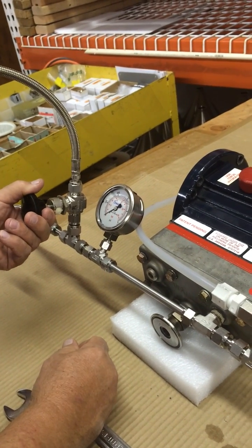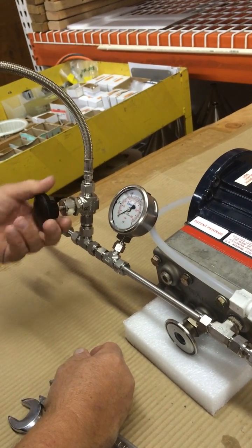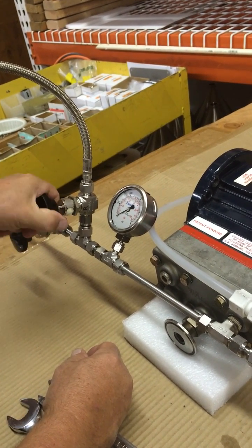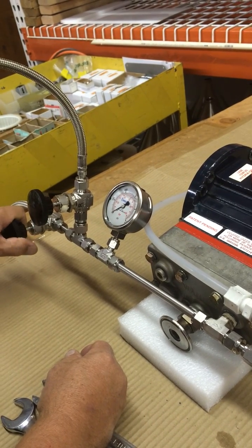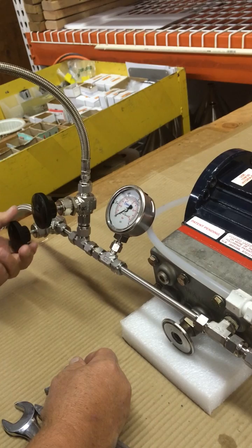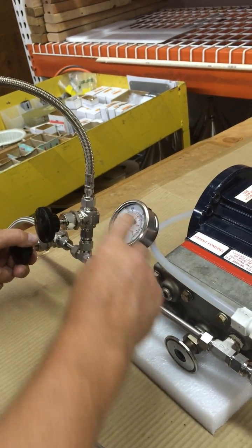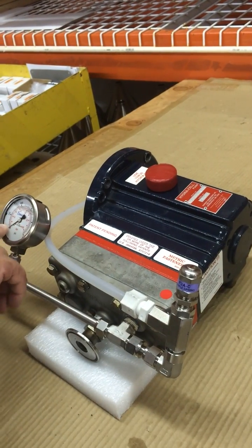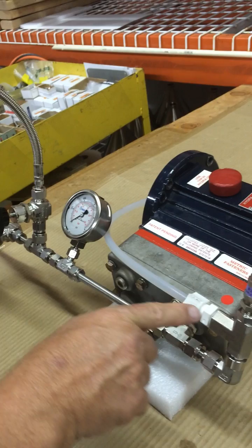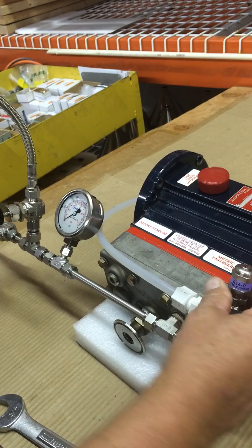We can close the concentrate control valve all the way — closed. Then we can start turning the concentrate pressure control valve in. If this is at zero, it's going to bypass and go right out, because the pressure is at zero.